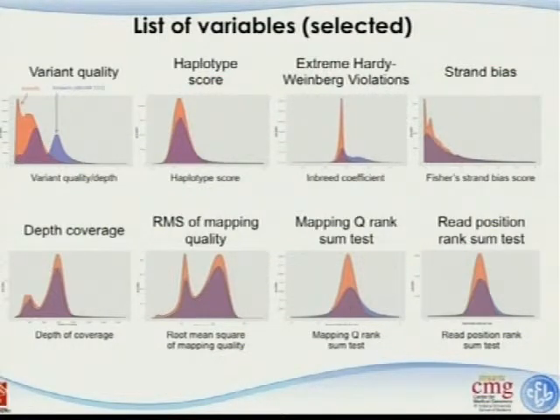dbSNP is not really complete, and a lot of the variants we identified are rare variants, so they are not going to be in there. But a lot of them are errors as well. So most likely it's a mixture of errors among all the novel variants. You can see that for the variant quality distribution, the ones that are already known follow these bimodal peaks.